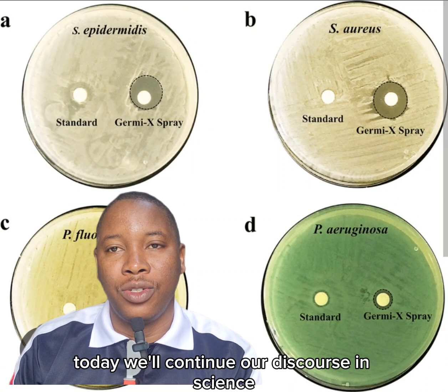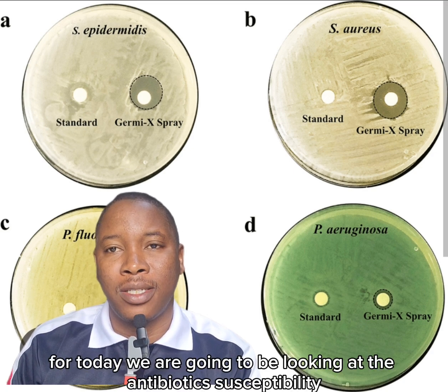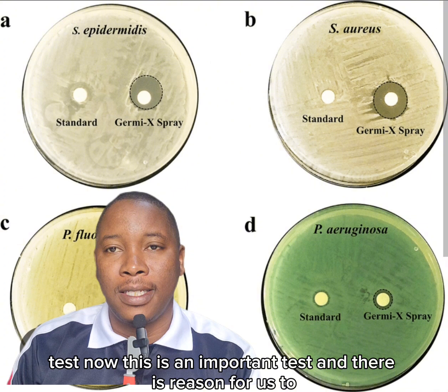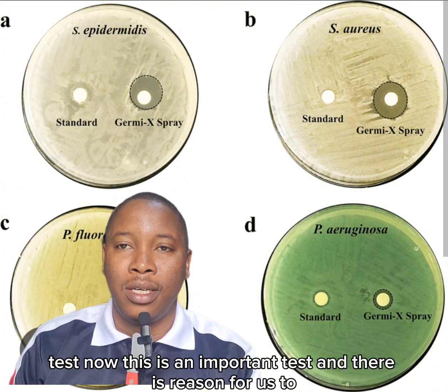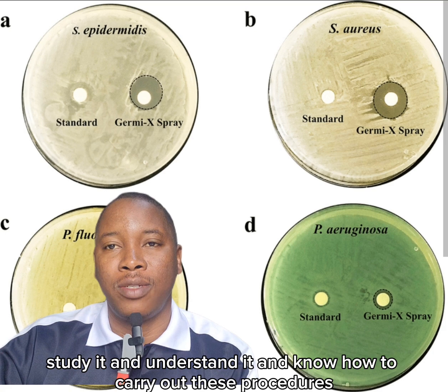Today, we'll continue our discourse in science. For today, we are going to be looking at the antibiotic susceptibility test. Now, this is an important test, and there's reason for us to study it and understand it and know how to carry out these procedures.